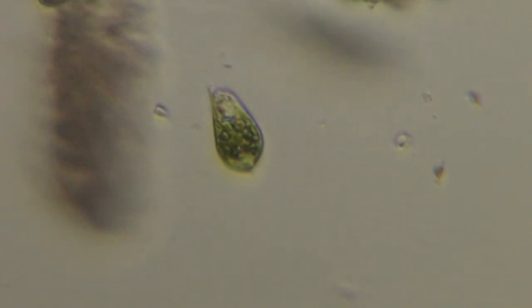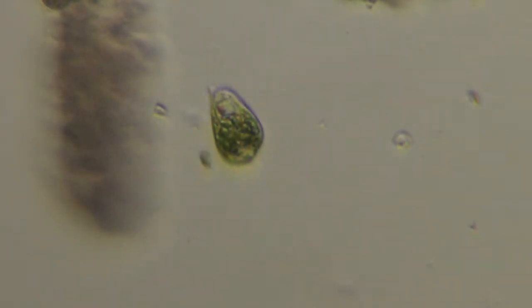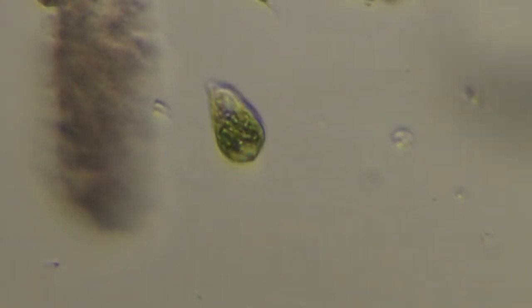And Euglena are interesting because they can change their shape drastically. They seem to be a little more gelatinous in the way they move than a lot of other protozoans at this scale. Paramecium are pretty rigid. They can bend and flex a bit, but they don't squish like these guys do. And see, this one's got a nice point on the back. Sometimes they can straighten out and be a nice, long, tapered cell, and other times they get all kind of squishy and bulged up like this one here. So they're quite malleable. Oh, this one's really cool, rotating.